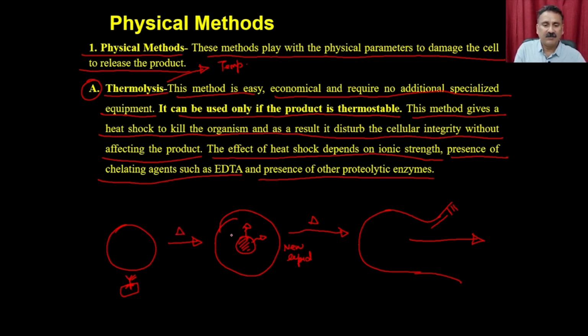Another way to explain this is that when you increase the temperature, the cellular molecules present inside the cell push the cell from all the ends, especially water molecules, and they create pressure. A cell under high pressure can withstand it as its volume increases, but if it cannot withstand that pressure, it is going to break the plasma membrane.